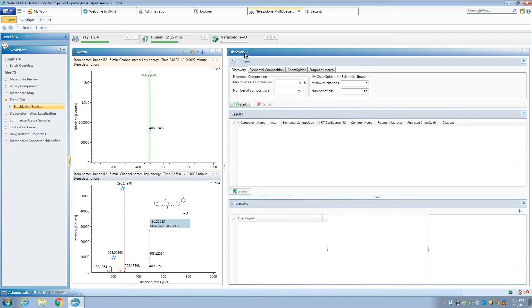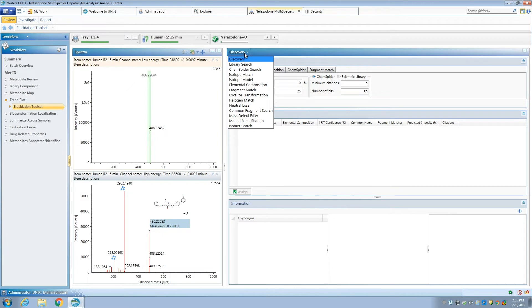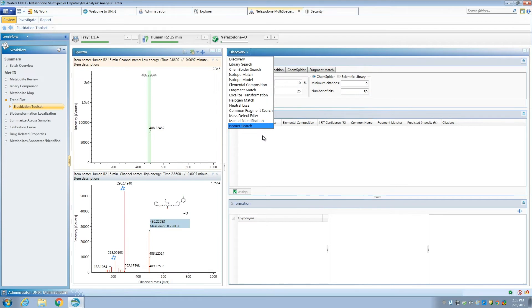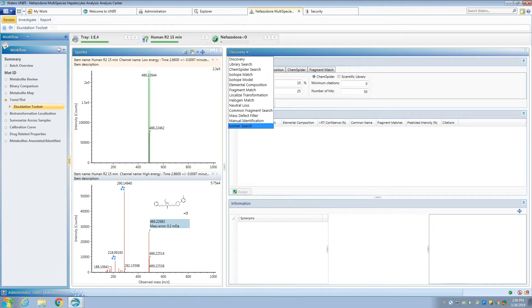We understand that metabolite identification is pretty complex, and that oftentimes you have to go beyond the day-to-day automatic workflows. Here, I'm going to show you how to use UniFi's elucidation mode. We can access a number of tools such as isotope match, isotope model, elemental composition, fragment match, and manual identification. All of these tools are available to assist with challenging metabolites that have unexpected rearrangements or have unpredictable changes.